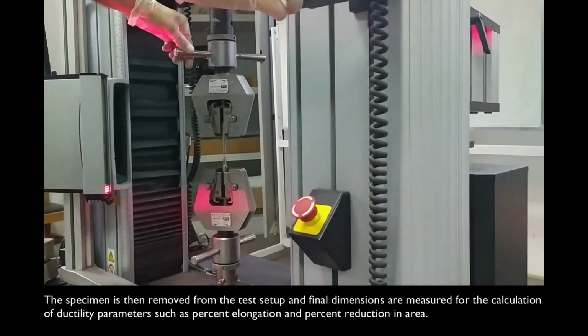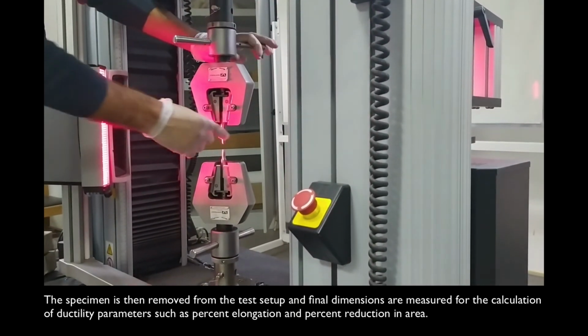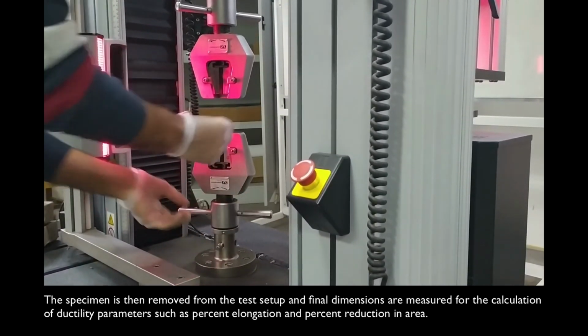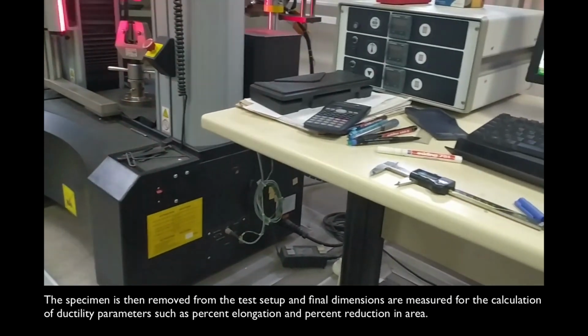The specimen is then removed from the test setup and final dimensions are measured for calculation of ductility parameters such as percent elongation and percent reduction in area.